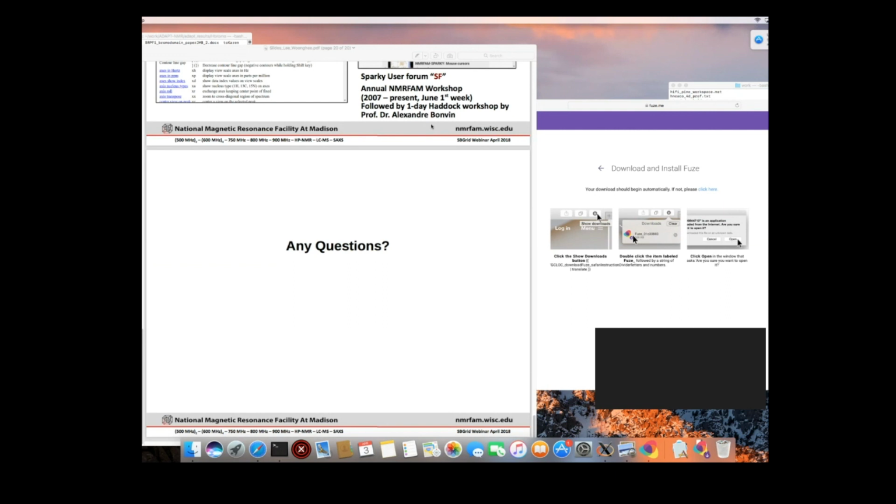So it really depends on your protein size, and I think also if you have a fragment in the database that really matches your protein, it will reduce the time. But I did not really do a systematic evaluation of CS-Rosetta by myself, so I don't know.